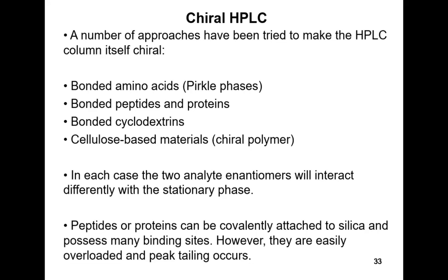The instrument has more than one column. It depends on the compound. We use sometimes 4 columns, 8 columns, and I know one exceptional case where we used 12 columns, which compound included more than 3 chiral carbons. Okay. Yeah, we have some different states as well. So it's not 2 isomers, it's 3 or 4 or 5. So the columns are separating all the compounds at different levels. I don't know how the instruments work, but it automatically separates every compound into a different bucket.